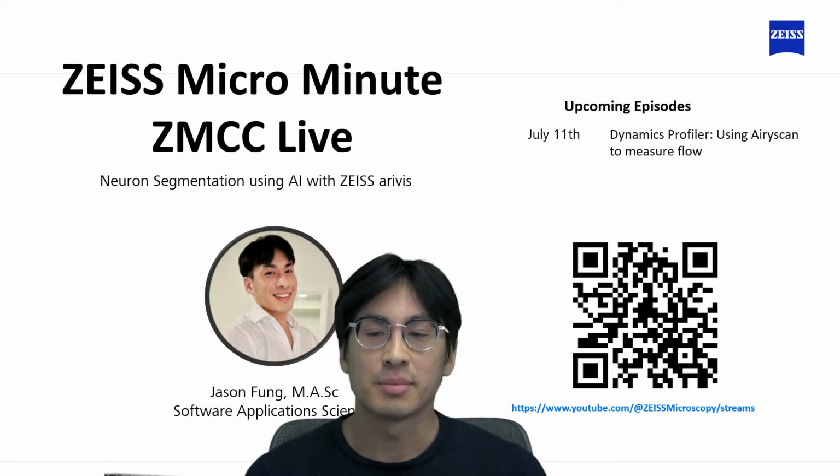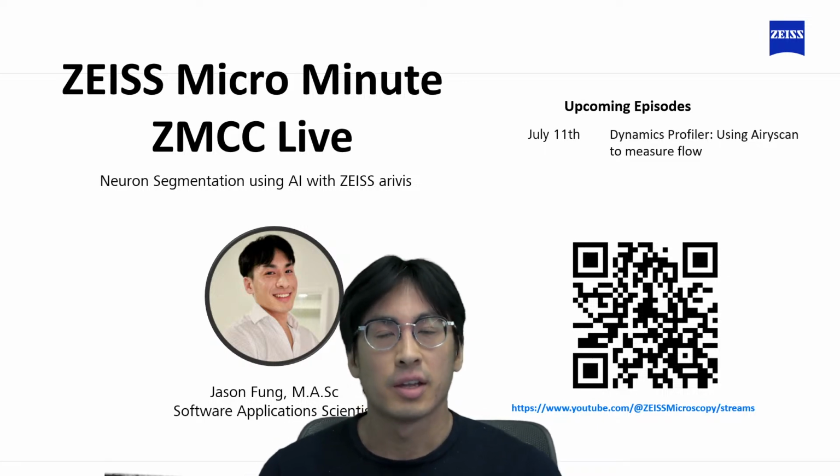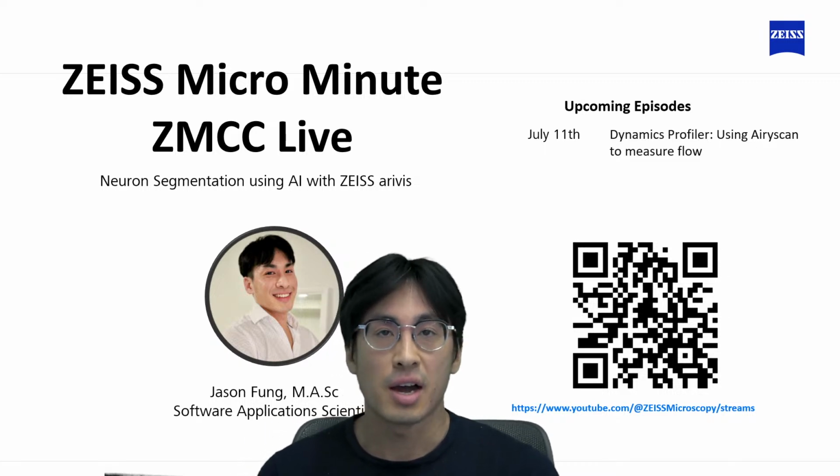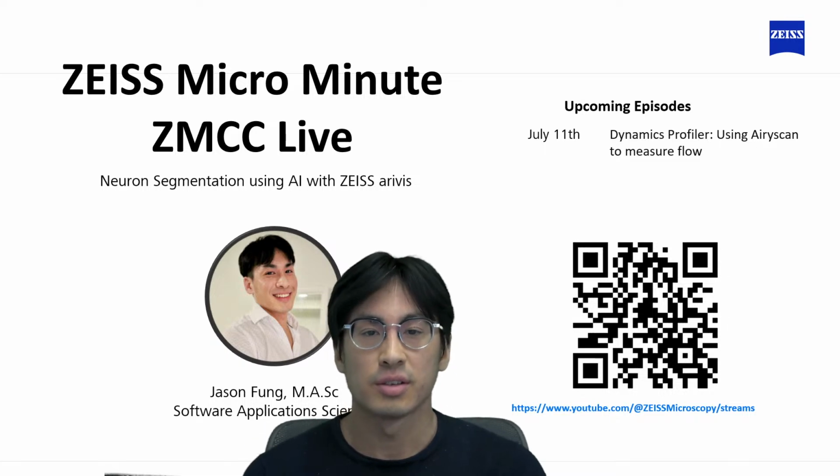We're here live at ZMCC in Dublin, California, and today I'll be talking to you about neuron segmentation using AI with our ZEISS arivis suite.